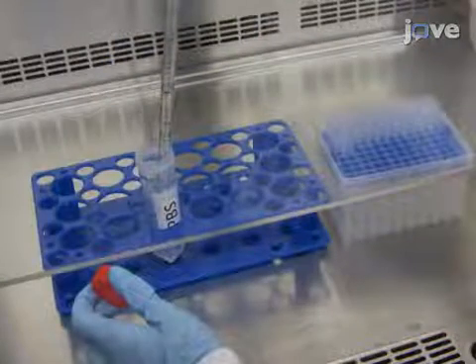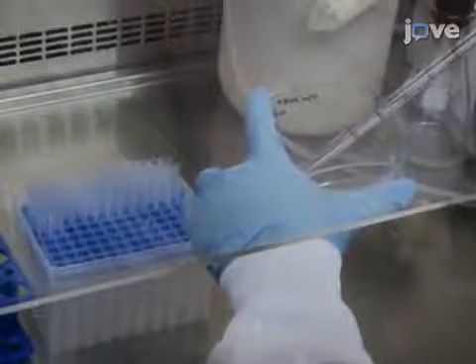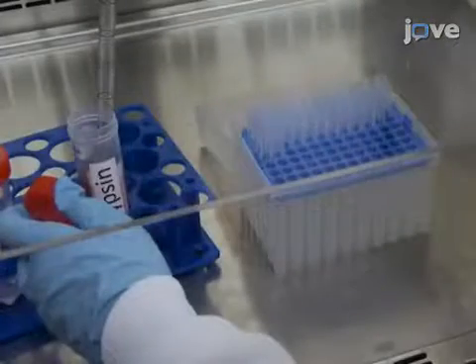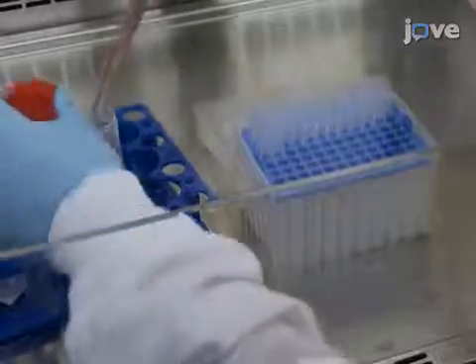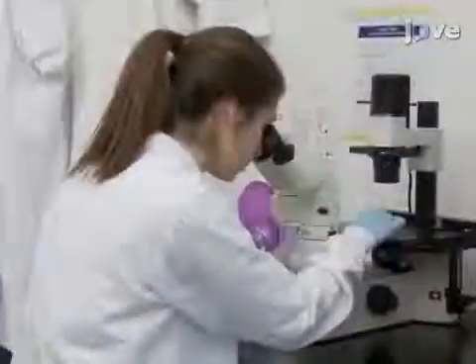Next, in a biosafety cabinet, wash a 70% confluent cell culture with PBS and detach the cells with 3 by 3 milliliters of trypsin-EDTA dissociation buffer in a cell culture incubator. After a few minutes, inspect the cells under a light microscope at 10x magnification.